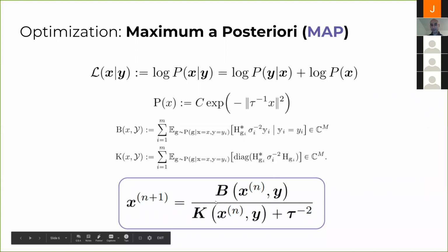So what happens is that you end up regularizing. And this regularization is basically saying something about how much you suppress different Fourier components depending on how much confidence you have in them. So you end up regularizing different Fourier components differently depending on how much confidence you have in them, and how much information you allow to be propagated into the next iteration.